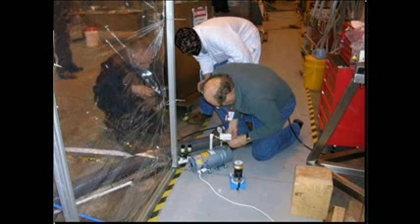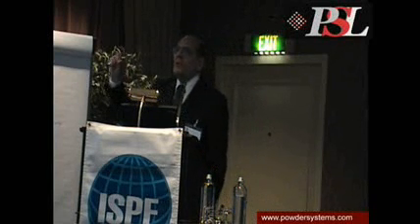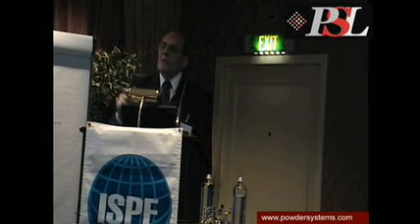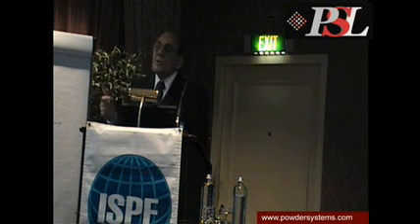There's the pump. There's the vacuum brake. And you can see this is a field validation spike. I don't know if you do this. What we do is we create a spike sample. The lab provides a sample spike with a low concentration of lactose or naproxen or whatever we're using on the media, and we run it side by side with a blank that's just pulling ambient air. Because we want to be sure that during our handling, shipping and sampling, we haven't adulterated or biased our assay.